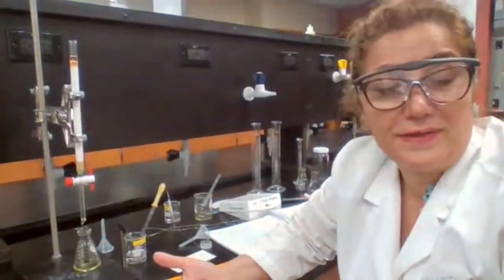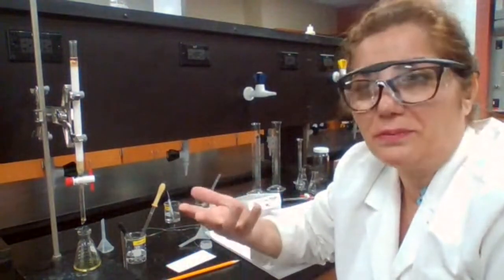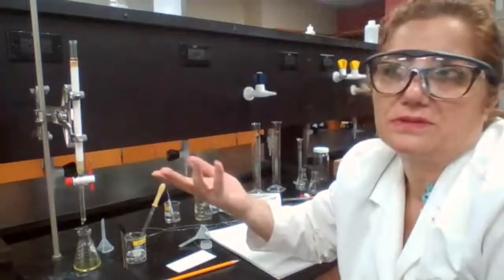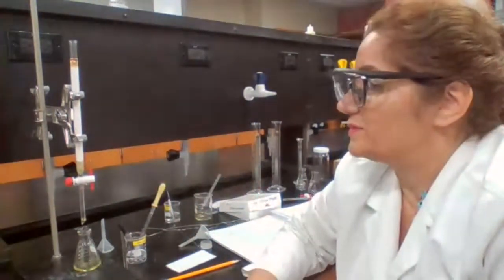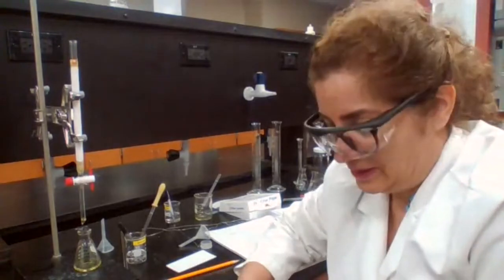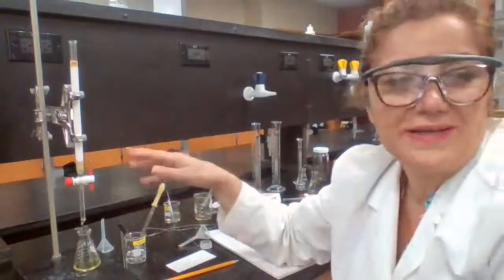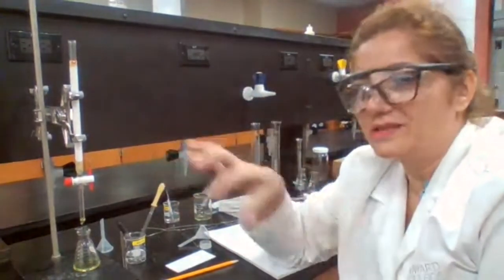Like using fingerprint is perfect when you have a bank or database with the fingerprints of the people that you would suspect, right? If you don't have the data set or the bank, then one single fingerprint is not going to help you to solve the problem. It's a very similar idea here: you have to compare unknown to a set of known samples.